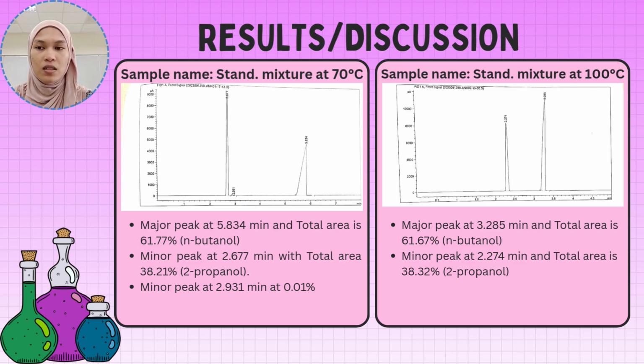This decrease in retention time is due to increased analyte volatility at higher temperatures. However, the peak areas remain almost unchanged, indicating that the temperature does not significantly affect the relative composition of the mixture.